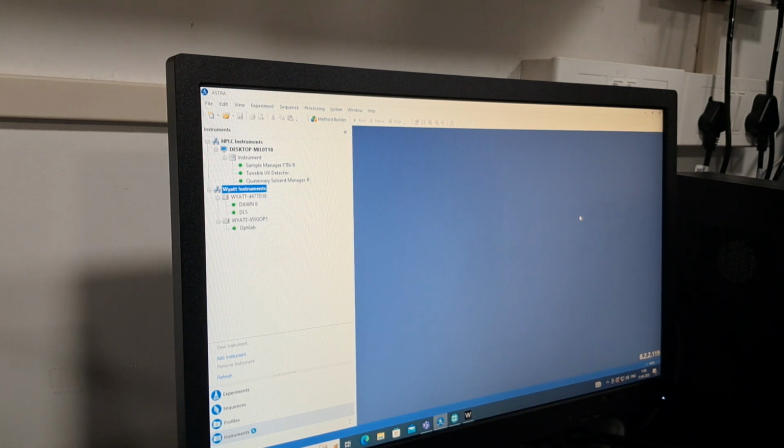They are trained particularly in this buffer system, so they always prepare it. That is the standard protocol every lab maintains. So I'm not using this one. I don't want to mix this and this directly. So I will use this one directly.